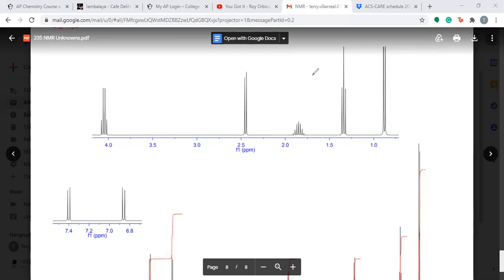All right. So just remember NMR, it's a logic puzzle. Just think about how many peaks, that tells you how many neighbors there are. Think about things like, is it a para-substituted benzene ring? Is it monosubstituted? Do I have an isopropyl? Do I have a tert-butyl? What's my degrees of unsaturation? And then just try to combine your pieces together in a way that makes sense. So don't stress too much. And then for IR, just look for whatever functional groups you can, get in, get out, bam, you're done.